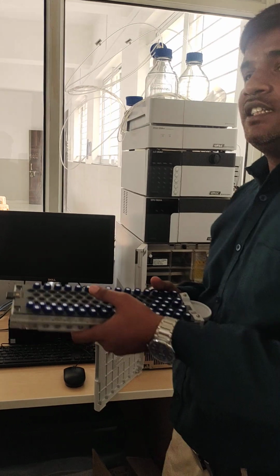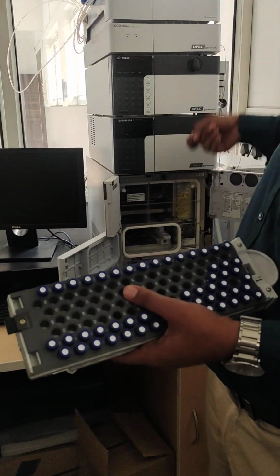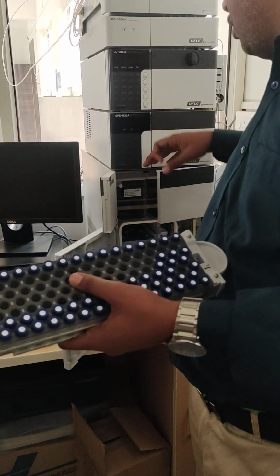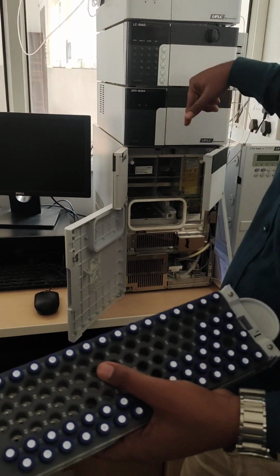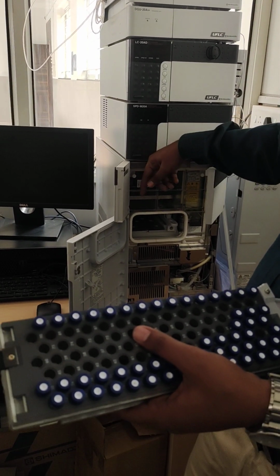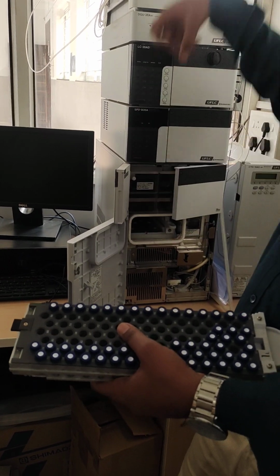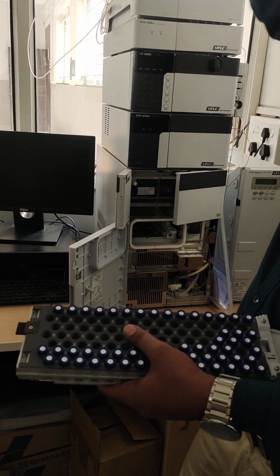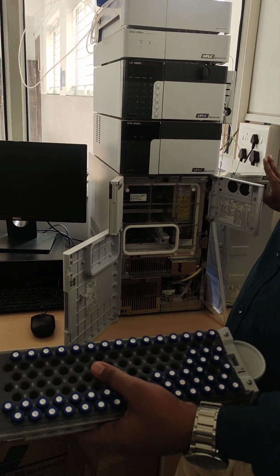How does it work? This steel body will move in an upward direction initially, then go to the rinsing section, and after the rinsing section it will come and pick up the sample from the sample cell, where we are keeping it. It will push or pull out the samples, then supply them to the column.